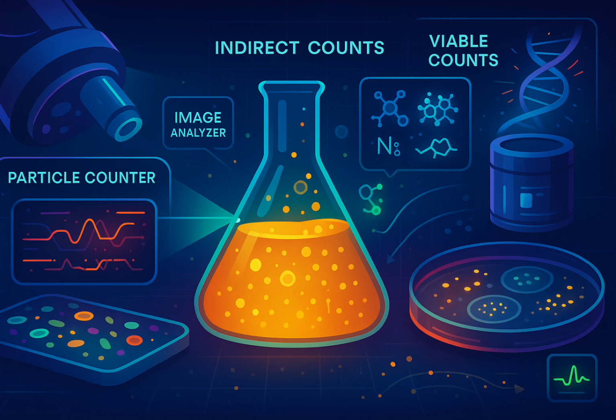And real-time PCR, qPCR. That's the quantitative version. Real-time PCR, qPCR, uses fluorescent dyes or probes that glow when the target DNA is amplified. The machine tracks the fluorescence increase cycle by cycle. How quickly the signal appears tells you how much target DNA you started with.